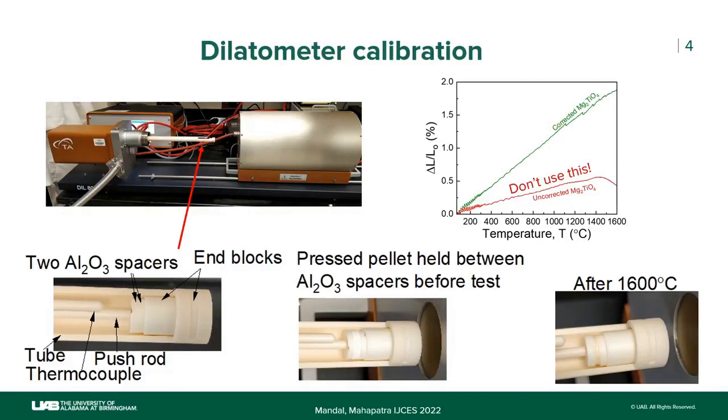Say you have a castable and it has 10% of a certain grade of aluminum oxide, and you want to try a different grade of aluminum oxide, replacing that 10%. What normal people do is they just replace that 10%. But you don't know what this 10% new alumina is interacting with in the other parts of the composition. So the big question is, is this alumina the same as the original alumina, or is it different?